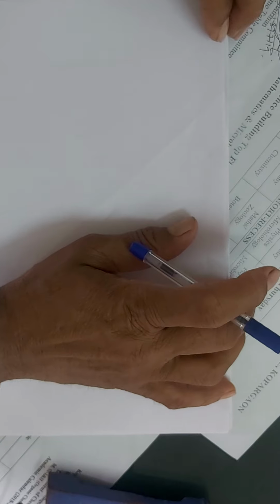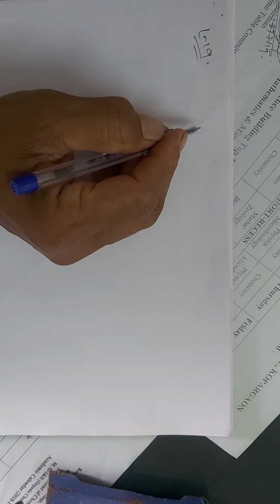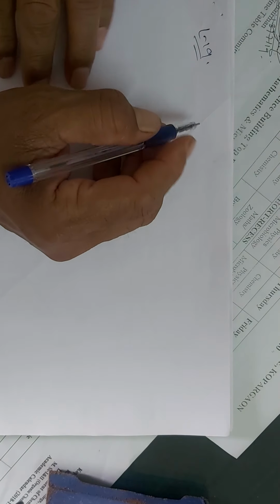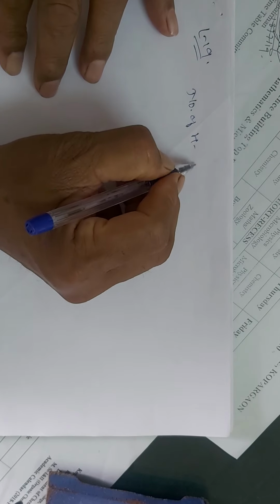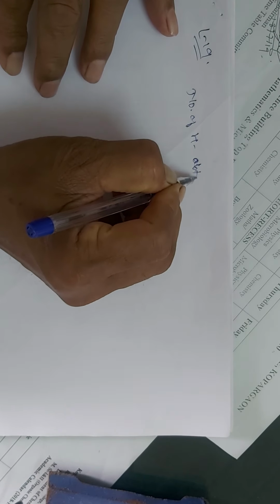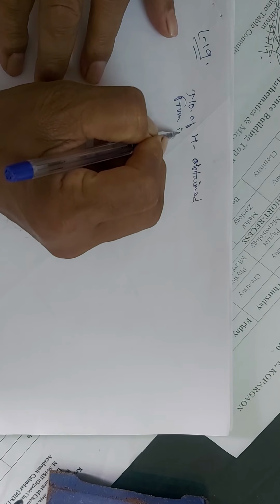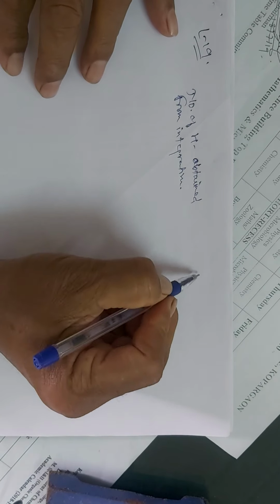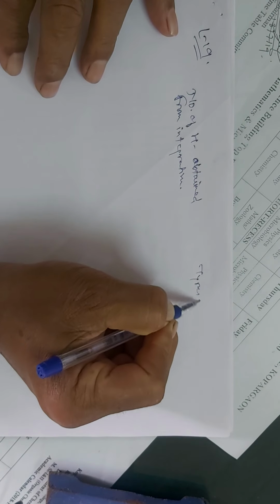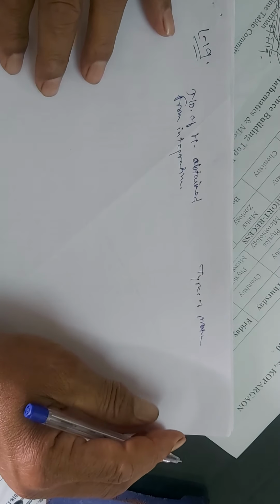And so here we will just see the number of protons obtained from integration and the types of proton. So here, what will be the different types of protons?